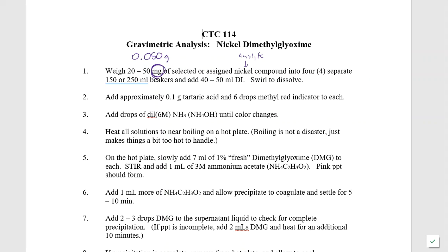So swirl them and make sure that they dissolve. That's a key word, right? We've already talked about the importance of dissolving the salt in the very beginning. So right there, if your salts do not dissolve, you got a problem. Because if they can't dissolve, it doesn't free up the nickel. If it doesn't free up the nickel, the nickel's not single. If the nickel is not single, then you can't go in and add the reagent to the nickel in order for it to give a compound. That's the issue. Make sure it's fully dissolved.